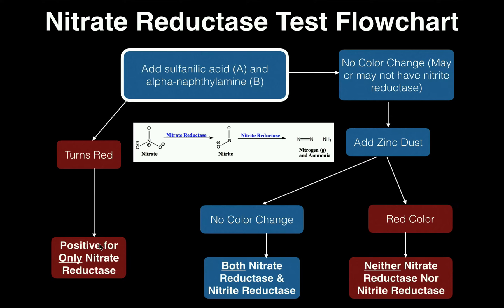We did inoculations for the nitrate reductase test or nitrate broth, put it in the incubator, and now we're going to take it out and start running results. The first thing we do is add sulfanilic acid and alpha-naphthylamine. Depending on where you're taking this course, sulfanilic acid is sometimes called solution A and alpha-naphthylamine solution B. Your manual says to add 16 drops of each — 16 drops of sulfanilic acid and 16 drops of alpha-naphthylamine.